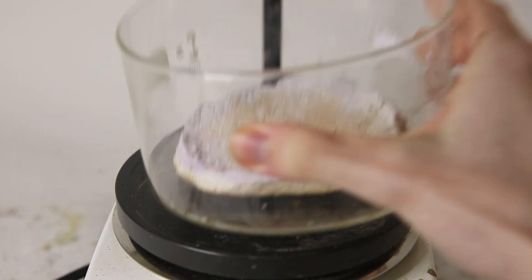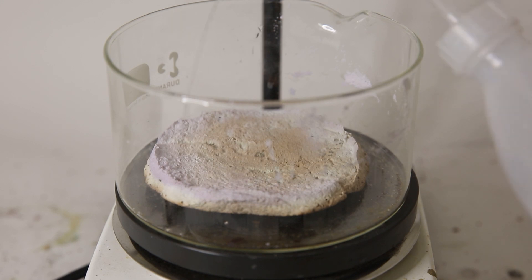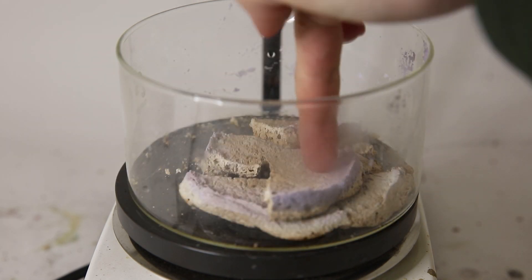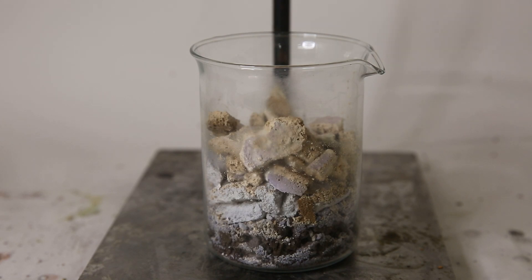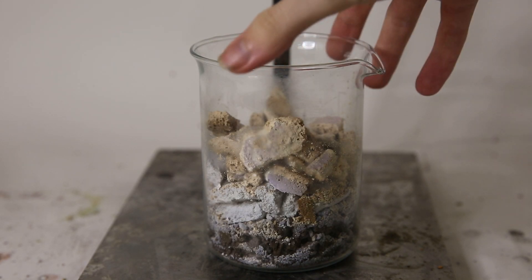To get my silver chloride cake out, I just wet it slightly and it breaks apart nicely. So this is all the silver chloride I have from all runs. Some are a lot more discolored than the others because it has been standing for longer.